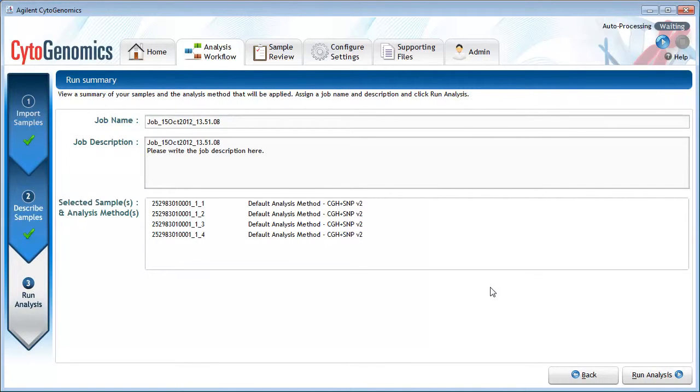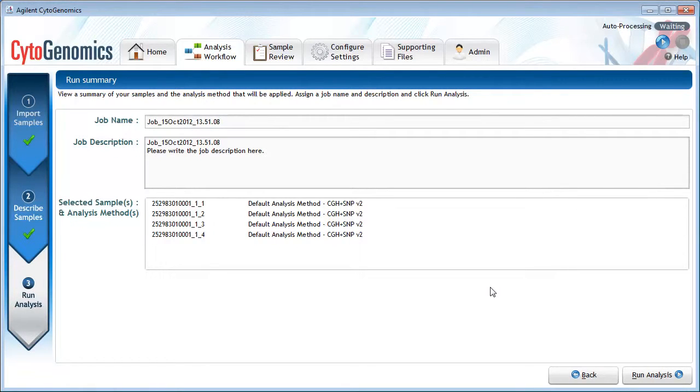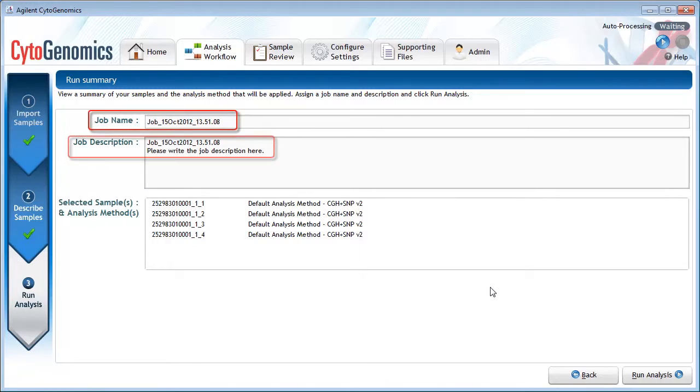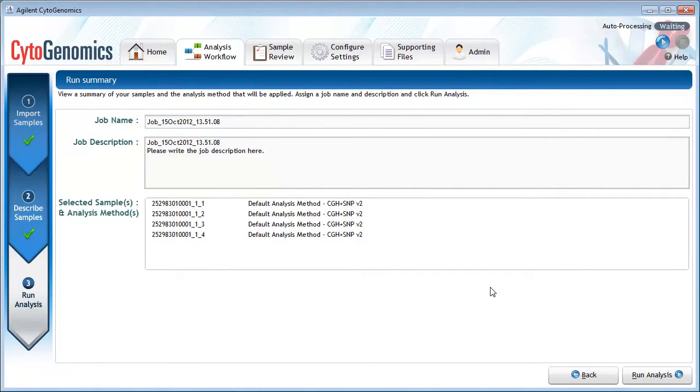The screen then displays a summary of the workflow job you are about to submit. If desired, you can edit the job name and description. When you are ready, click Run Analysis to start the workflow job.